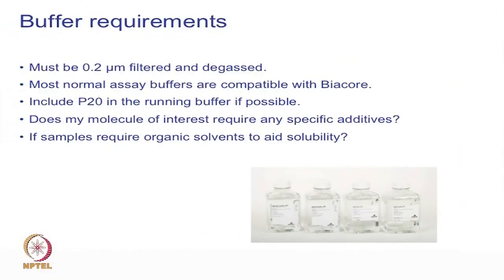A buffer, whether a running buffer or a sample buffer, is a very important area that we need to understand a little bit here. Buffers have to be filtered and thoroughly degassed. Many of the machines have a degasser and a filter available in the system, but it is obvious that we can also filter and degas them prior to experimentation.